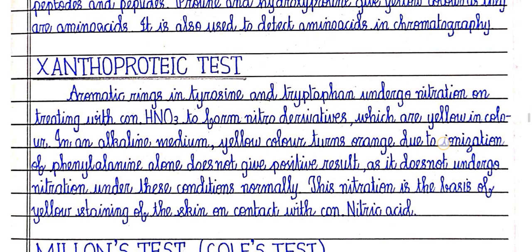Then xanthoproteic test. Aromatic rings in tyrosine and tryptophan undergo nitration on treating with concentrated HNO3 to form nitro derivatives, which are yellow in color. In an alkaline medium, the yellow color turns orange due to ionization. Phenylalanine alone does not give a positive result as it does not undergo nitration. Under these conditions, this nitration is the basis of yellow staining of the skin on contact with concentrated nitric acid. That is the xanthoproteic test.